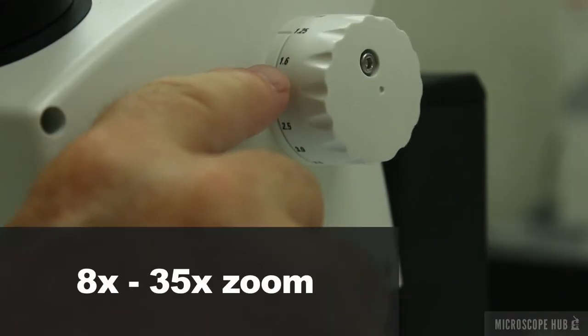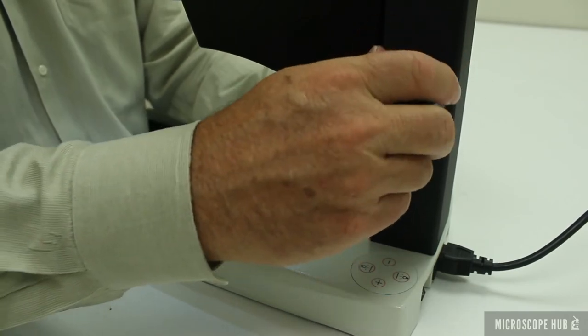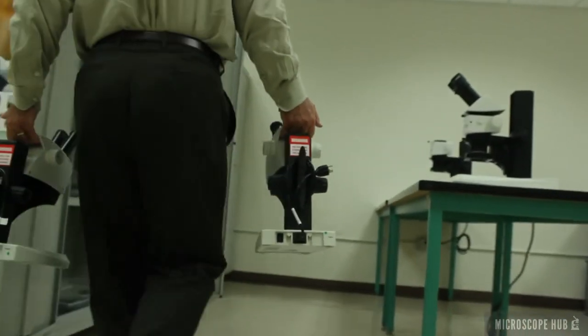It has an adjustable magnification knob for zooming in and a comfortable focus knob with tension adjustment. The eyepieces are locked in place and it comes with a cord wrap and a carrying handle for efficient storage.